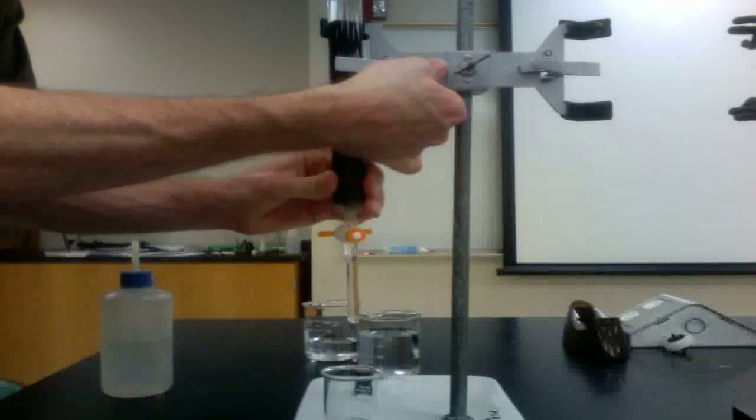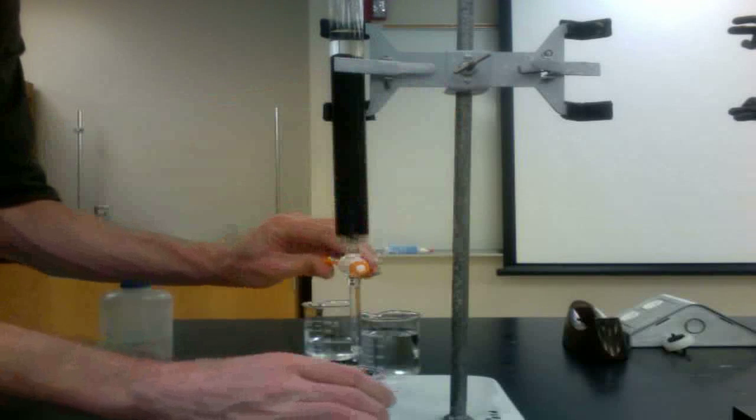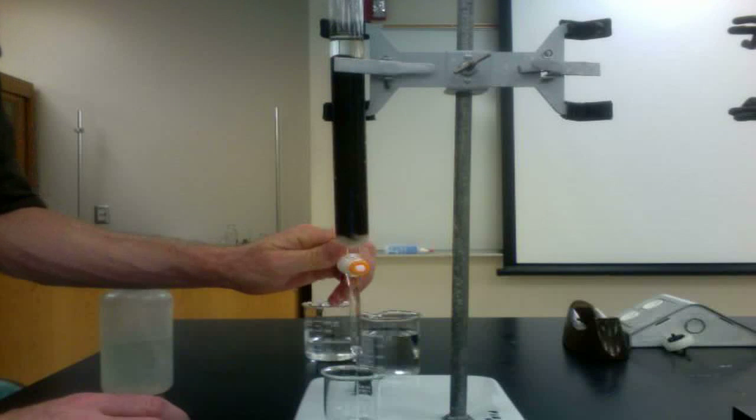The excess acid must be flushed from the column before the analysis can begin. This is done by rinsing the column with significant volumes of pure water.